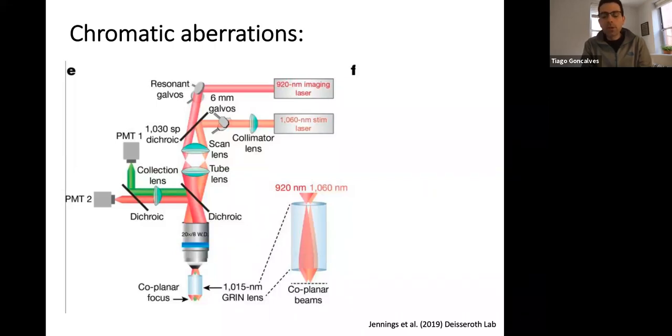The UCLA is one of them. There's another group at BU that has a dual wavelength. Part of that is they actually solved this problem, and there's a variety of different issues. This is one of the main issues. They separate the 2 channels in time. Because then you have an extra problem, which is you need 2 LEDs: 1 LED to excite, for example, the green, and 1 LED to excite the red. And you need to have the 2 LEDs have the same light path. So it's a kind of a complex problem. I won't go into it, but those are not commonly used yet. I think they'll start to be commonly used now.